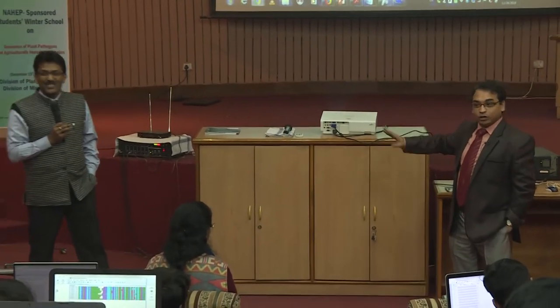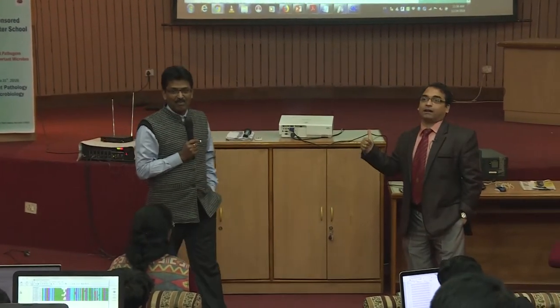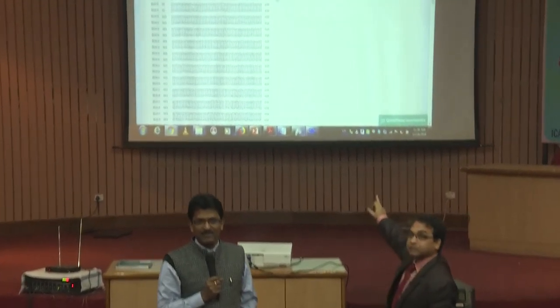So how do we rectify this problem? Reverse complement. It was told to you on Friday. This is the already deposited sequence here, and you cannot do anything with that. So you reverse complement your sequence and do the analysis again. Then it should show plus plus.